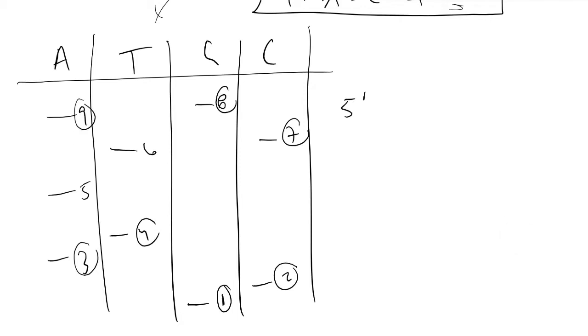Because the smallest DNA fragment that made it through had a guanine in it, it tells us that the first nucleic acid in the 5' direction that we were interested in is G. Because the second one was a C, it tells us it's a C. Because the third one was A, we know A, T, and we can continue this on and derive what the DNA sequence is of the unknown DNA.